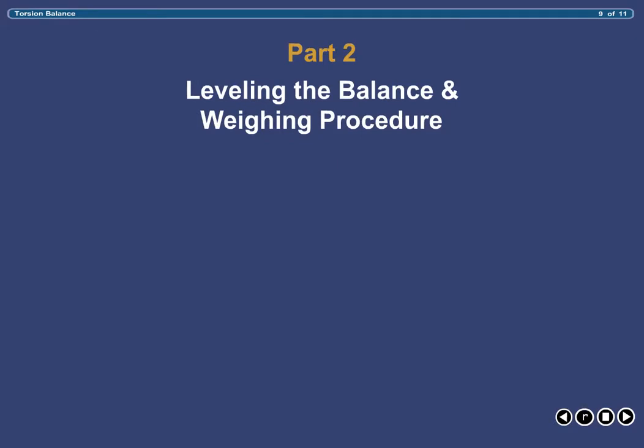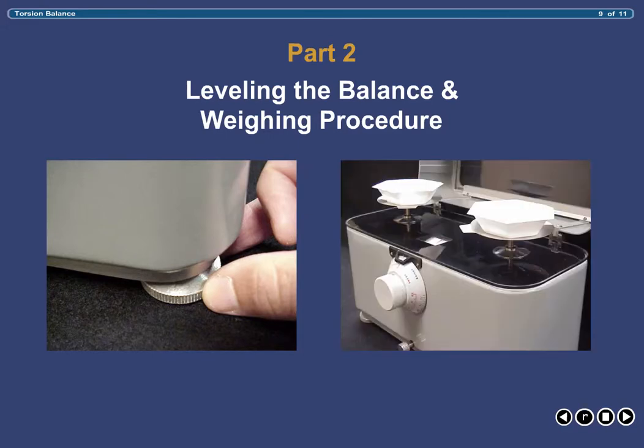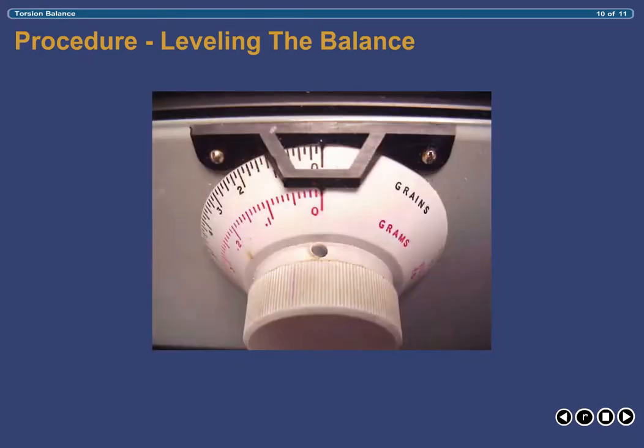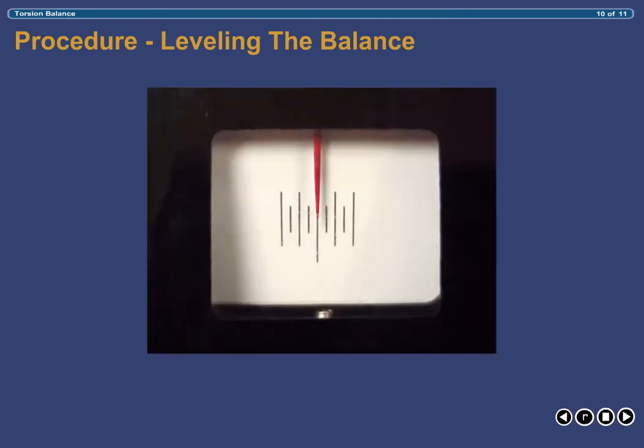The first step toward weighing is ensuring that your balance is level. First, ensure that the pans are absolutely clean and centered on the weighing arms. Then make sure that the weight dial is zeroed and the lid is closed. Next, release the pans by rotating the locking arm all the way counterclockwise. With the pans released, observe the pointer for movement. Should the pointer remain aligned with the long vertical marking in the center of the scale, the balance is level and ready for weighing. However, should the pointer move in either direction, leveling is required.